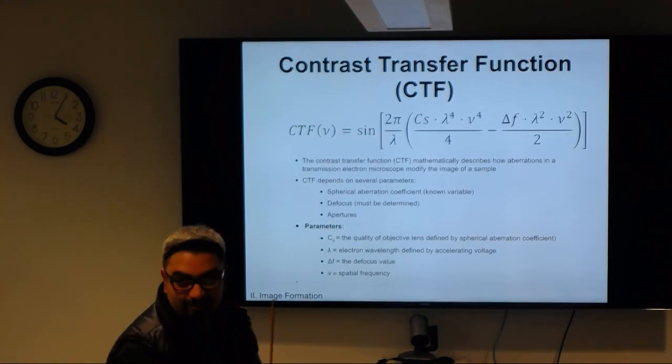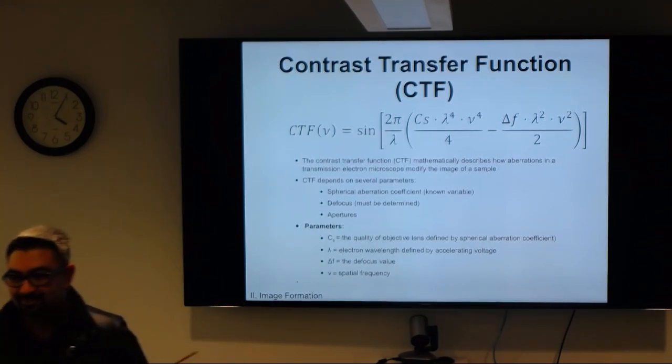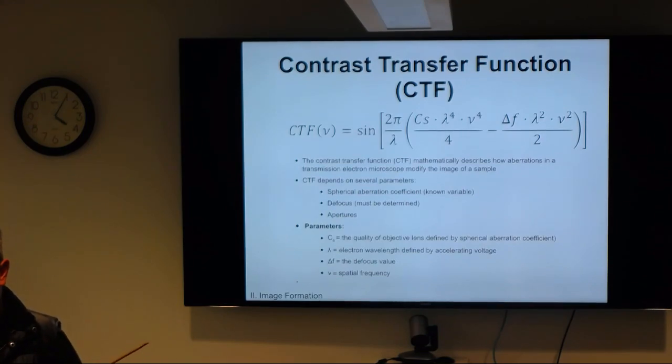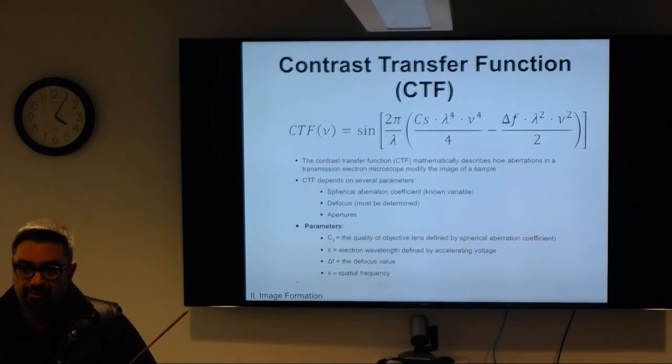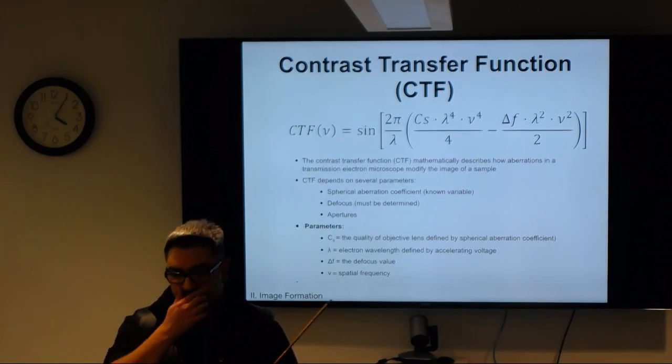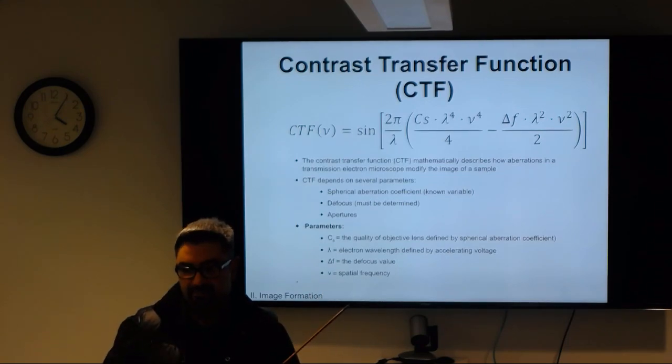And then, when you do that defocus, does it happen during the single image taking, or does it happen over a series of images? You change it basically every image. Okay, every image. And you give the software some range and tell it to go, and for each image it'll pick a different defocus value.